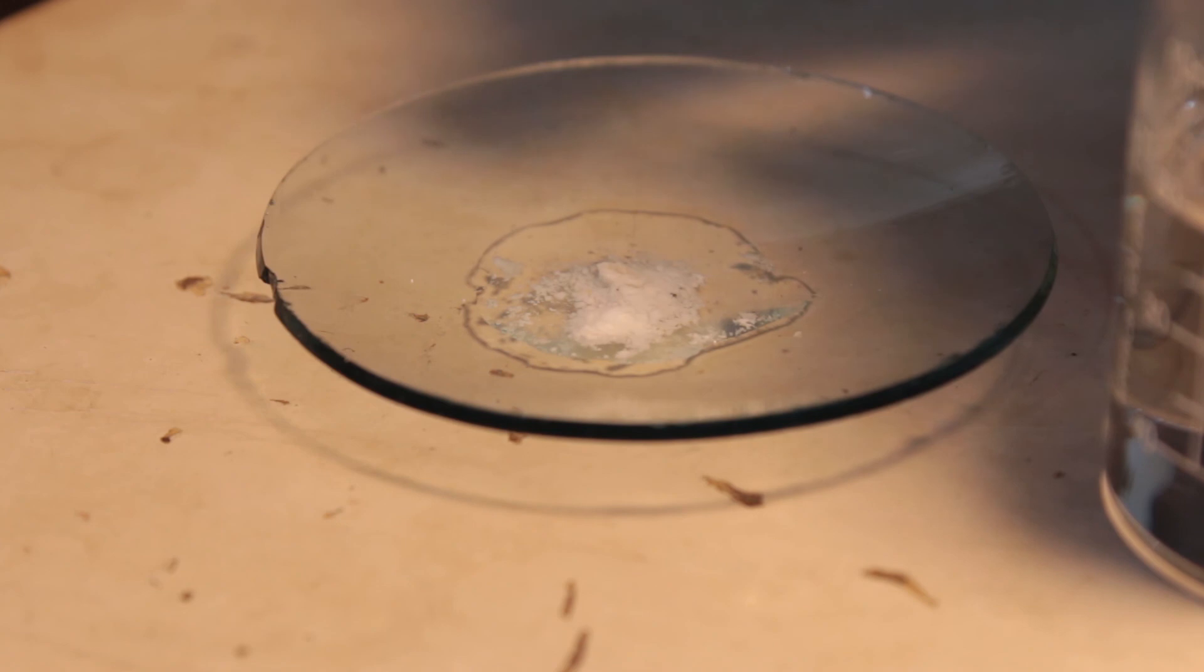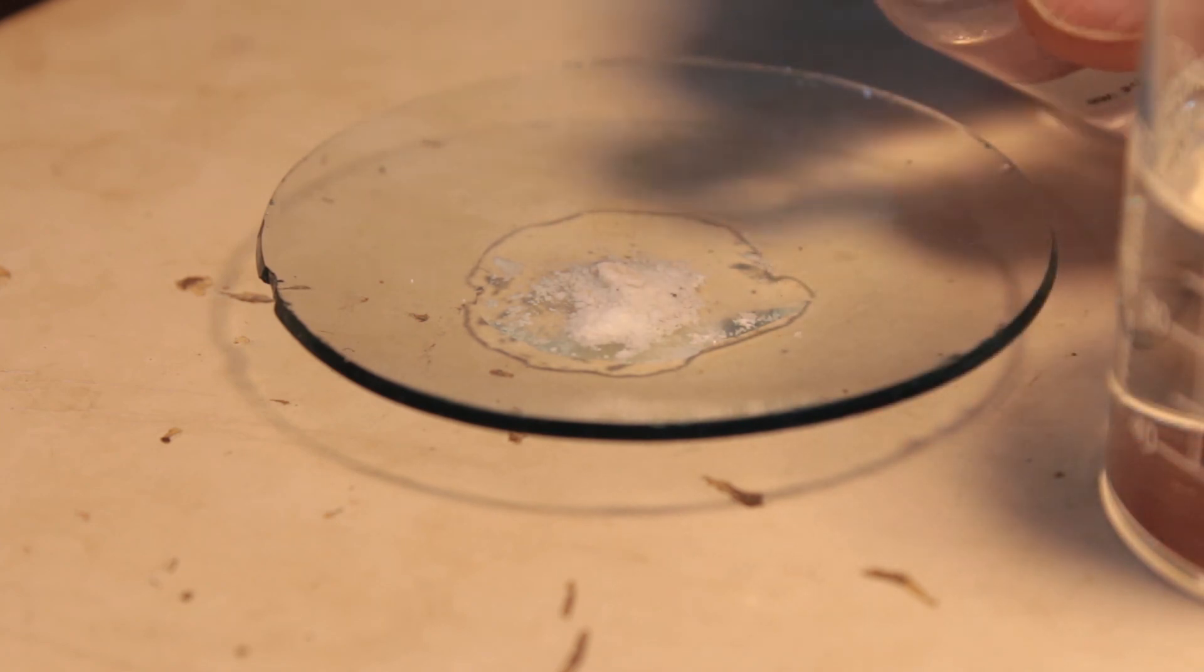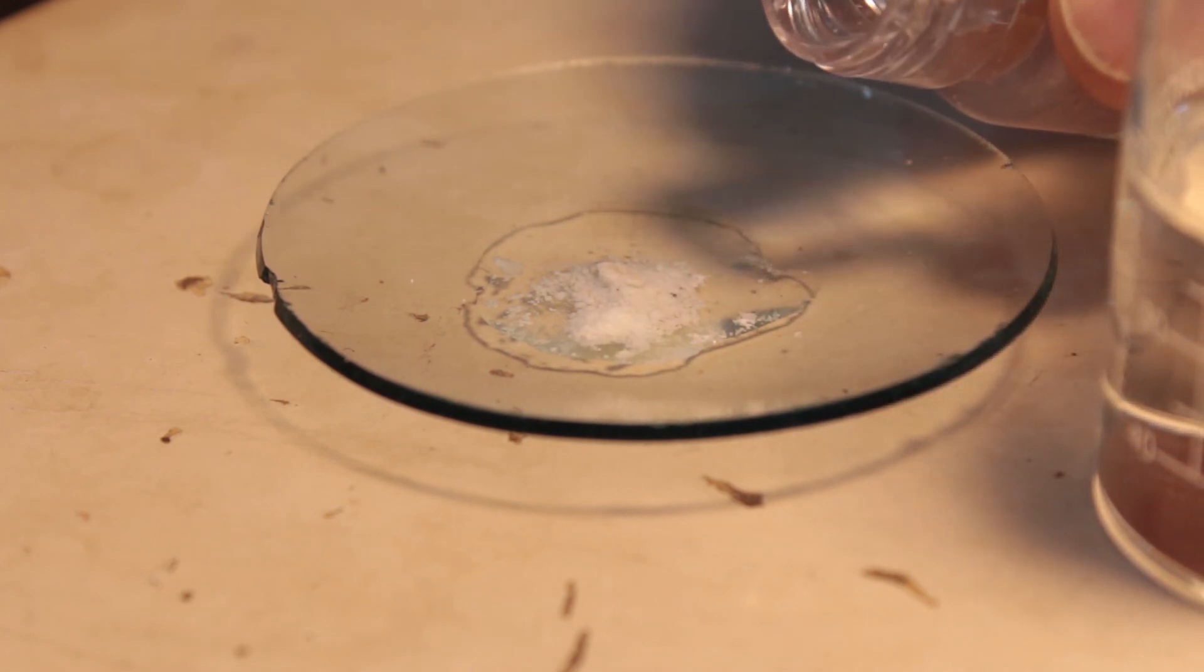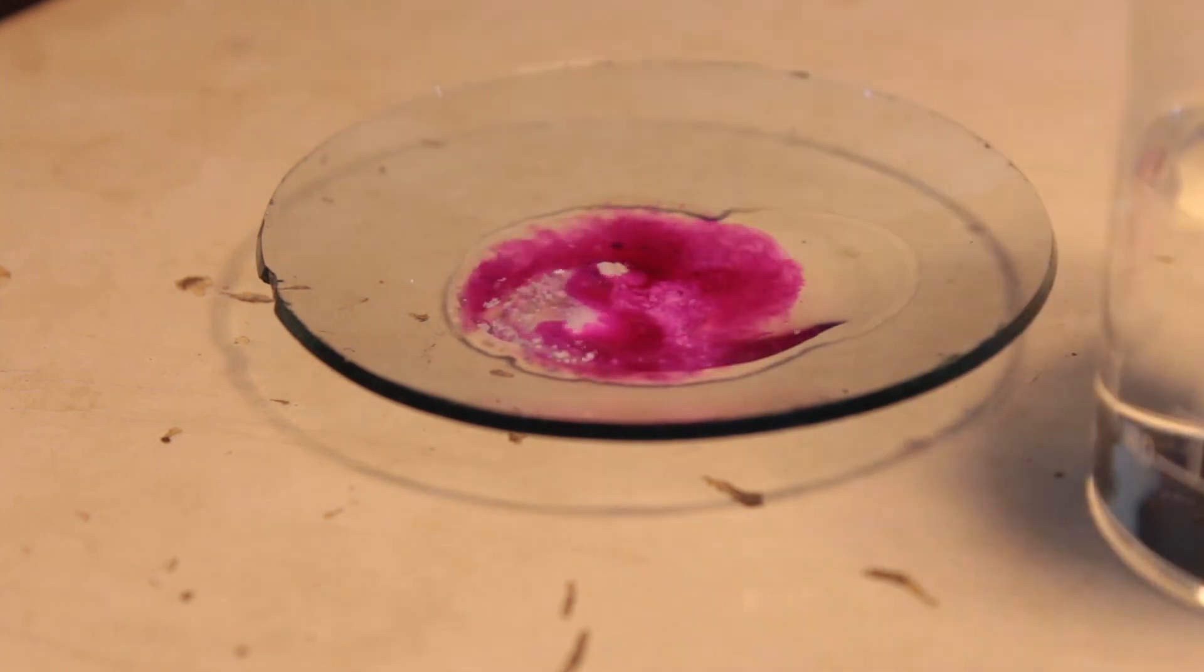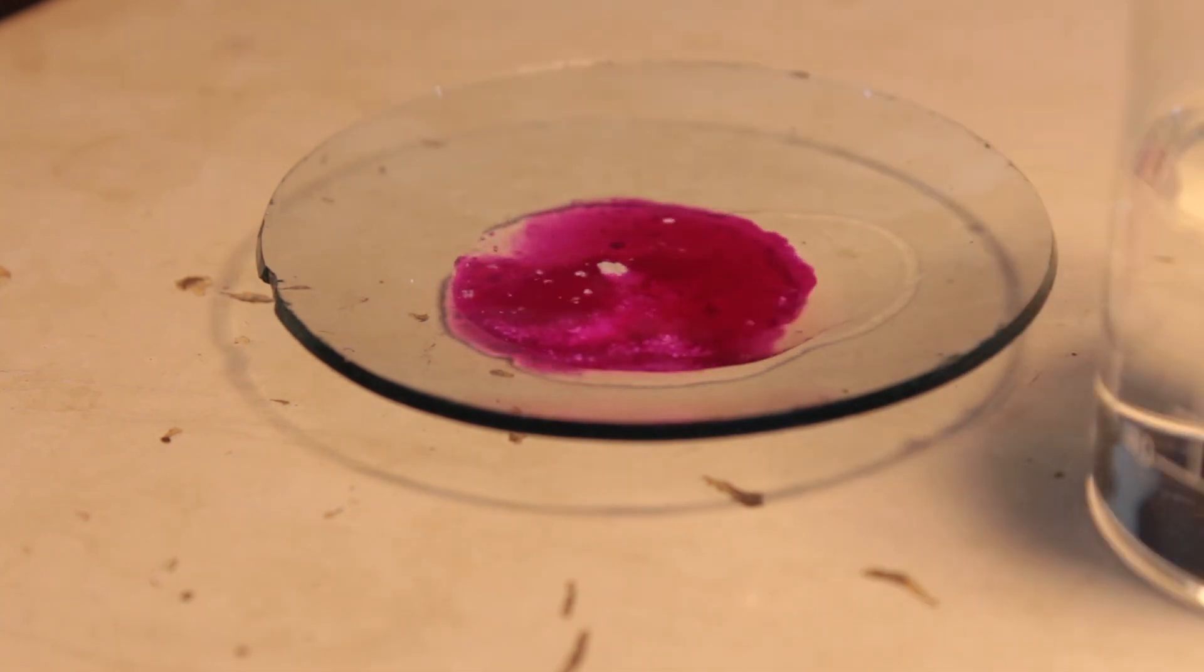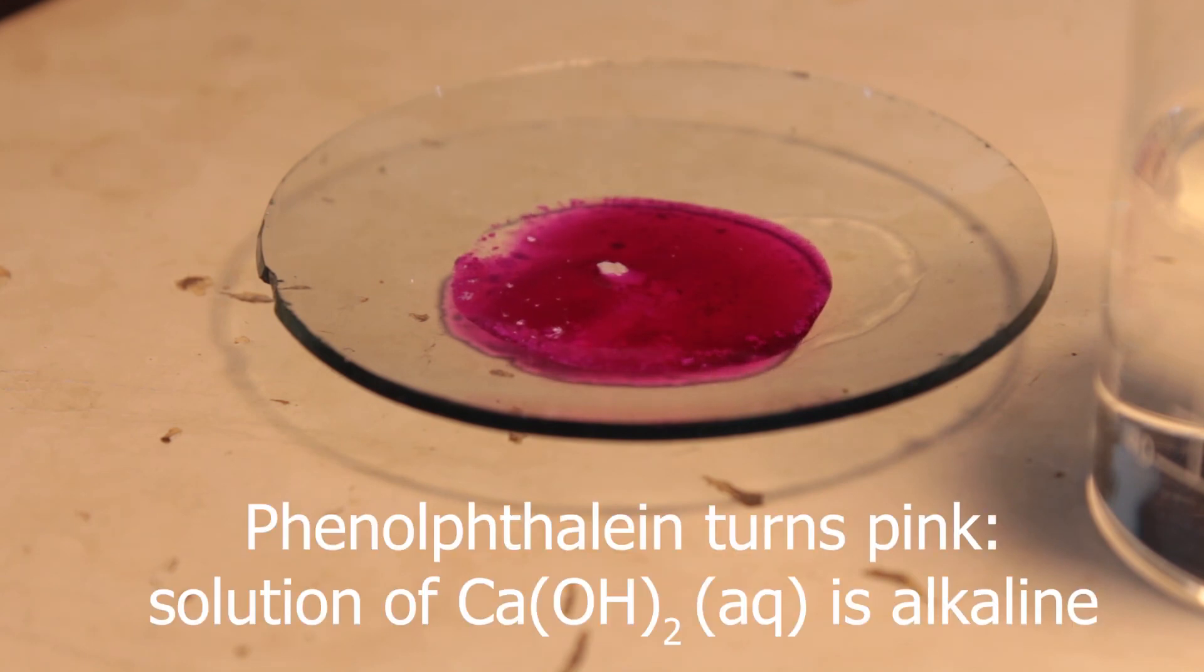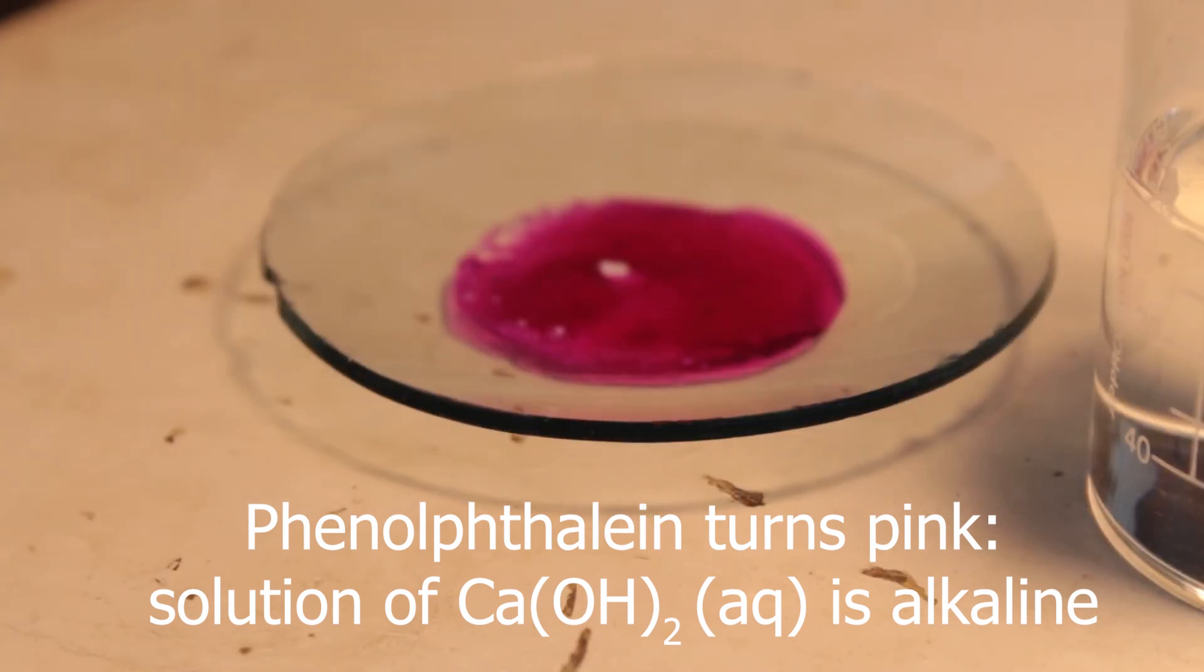Here, I'm adding it to lime water, because essentially when I dissolve calcium hydroxide in water, I get lime water. So here, I'm just checking that it's alkaline. My phenolphthalein turned pink, nicely showing that solution of calcium hydroxide is alkaline.